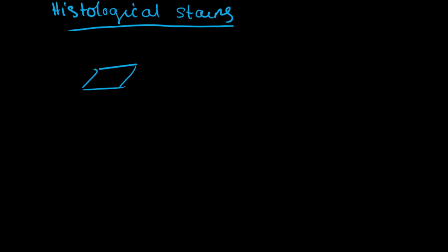This is why tissue staining is important. There are various dyes and stains used in tissue staining, essentially to increase the optical density. However, this applies to light microscopy.